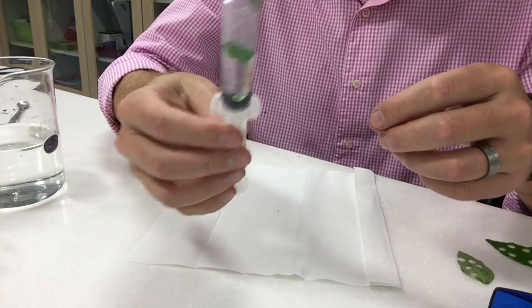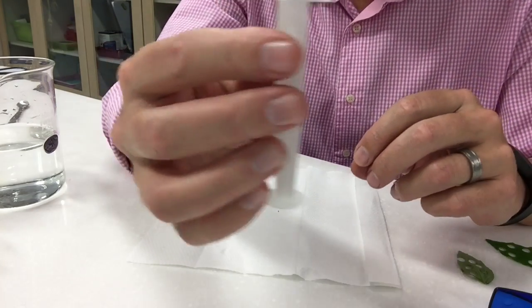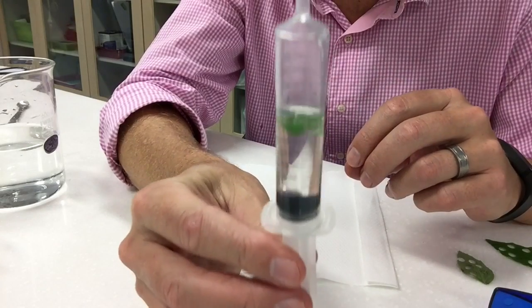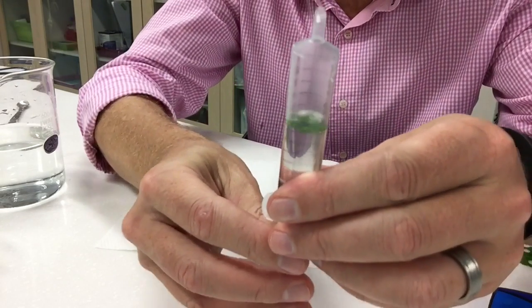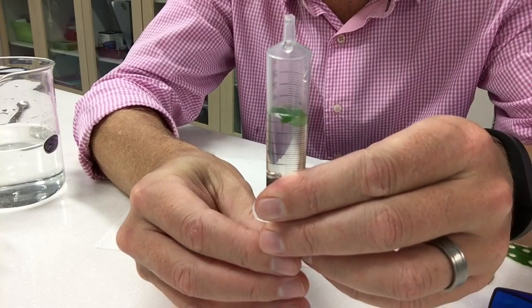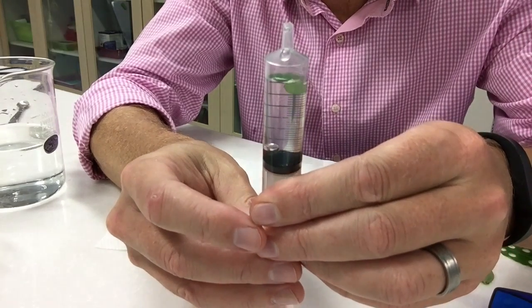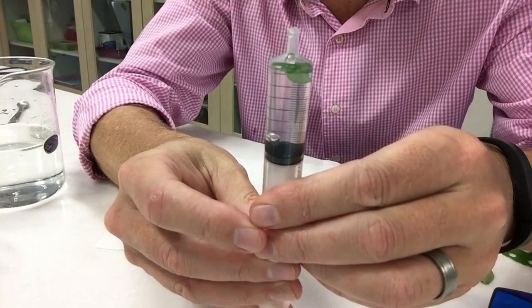So now you've got the solution of discs in the leaf and you can see they're all floating. So the way you get rid of this air and to try and get them to sink is to push them close to the top.